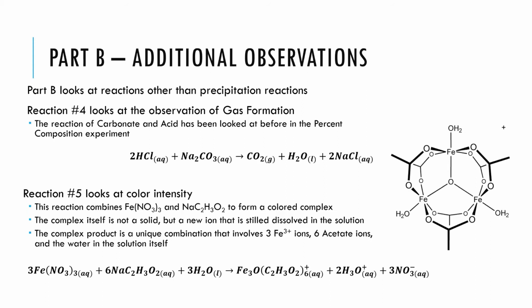You're performing the same setup, looking at the reaction, and then performing a chemical test on the reaction to see what is the limiting reactant. And you're doing this one based on your observations of gas formation. You're looking at the bubbles of carbon dioxide that are generated in the reaction.